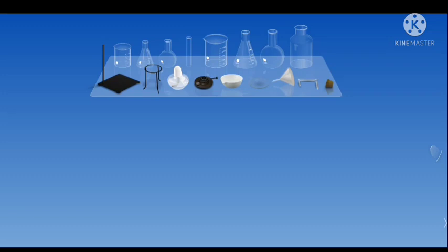Welcome to virtual chemistry lab. So today I am going to make you know about some apparatus which are very essential for our common practical, like sublimation, distillation, filtration. Already we have discussed lots of apparatus, but we don't know the name of that particular apparatus. So today we will talk.